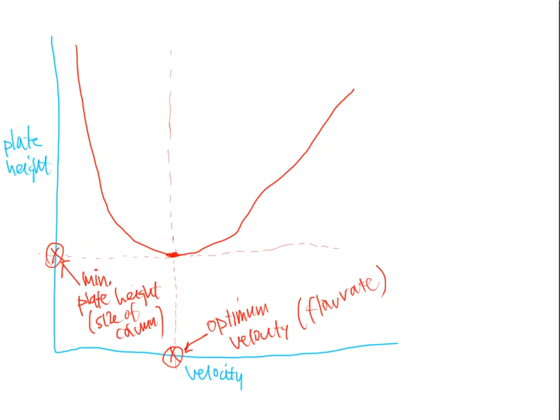That's one of the reasons that we never really use the Van Deemter equation mathematically, because there is quite a bit of math involved, and you can kind of imagine that going into this equation and solving some kind of number. But the graph of a Van Deemter will look the same no matter what.